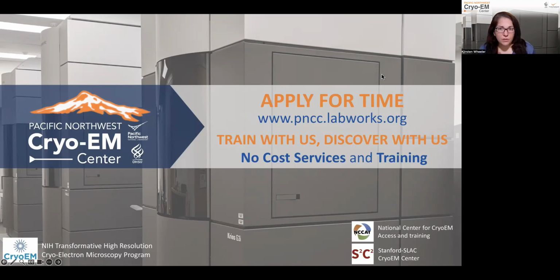PNCC has 5 microscopes. We have an Arctica with a K3 camera for screening and 4 Krios microscopes for data collection equipped with K3 and Falcon 4i cameras. 3 of our Krioses are equipped with Gatan energy filters. For sample preparation, we have 2 Vitrobots, a Leica GP2, and a Vitrojet, which is still undergoing validation before being offered to users. We are expecting the arrival of a new Glacios 2, which is actually happening next week. We are very excited about that.